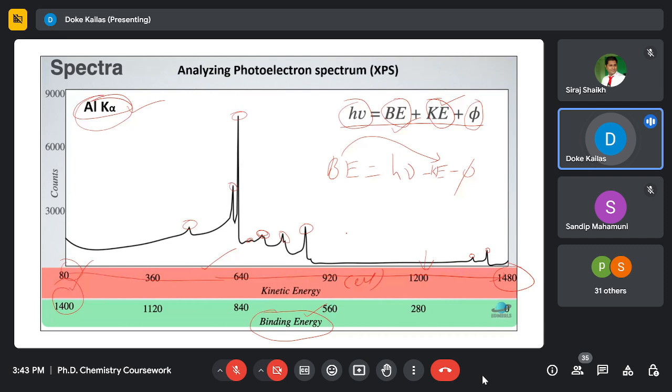Now, when X-radiation with energy is incident on these electrons, it can interact with possibly all electrons. Assuming that the 3p electron is a valence electron, 3s is the next shell which is inner, 2p is the next inner, 2s is the next, and 1s is a core shell.